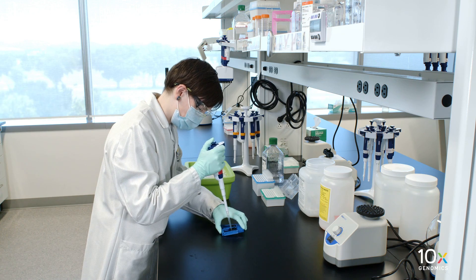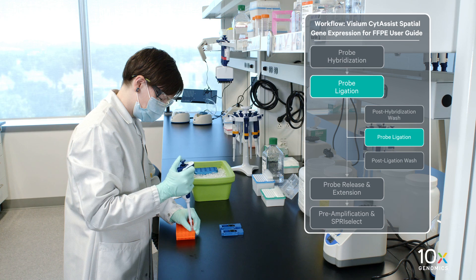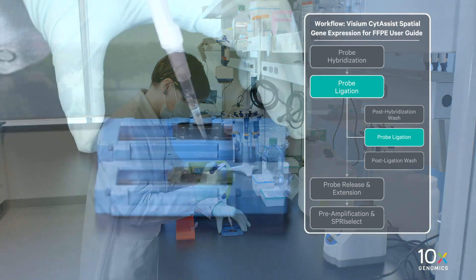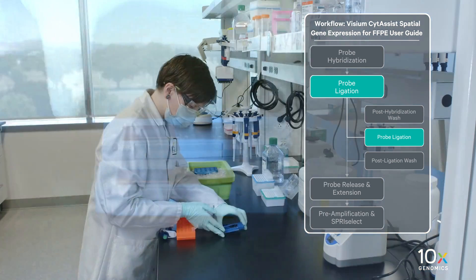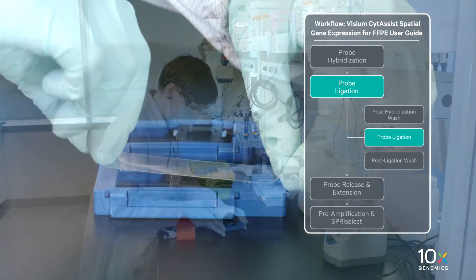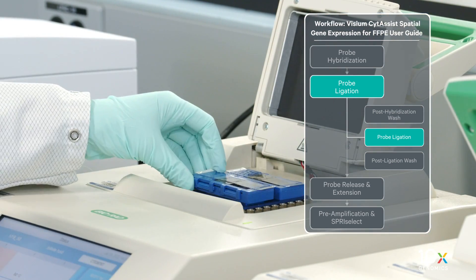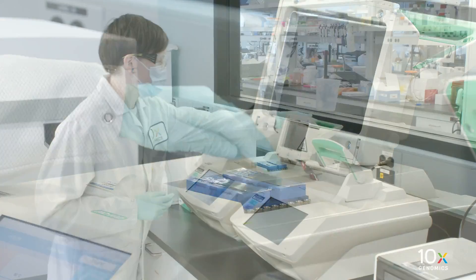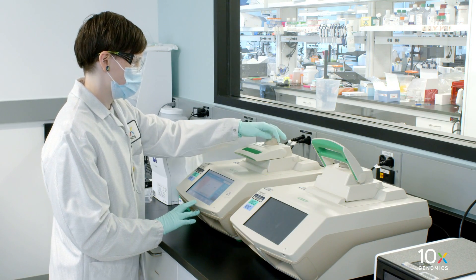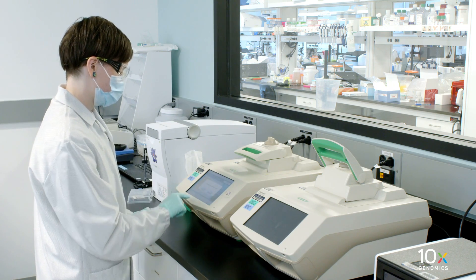Remove all 2X SSC buffer from the wells. Add 130 µL of probe ligation mix directly to the tissue sections without introducing bubbles. Tap the tissue slide cassette gently to ensure uniform coverage. Apply a new pre-cut Visium Slide Seal on the tissue slide cassette and place on the low profile thermocycler adapter on the preheated thermocycler. Close the thermocycler lid. Skip the pre-equilibrate step to initiate ligation.